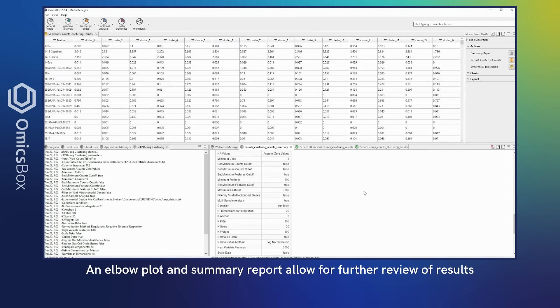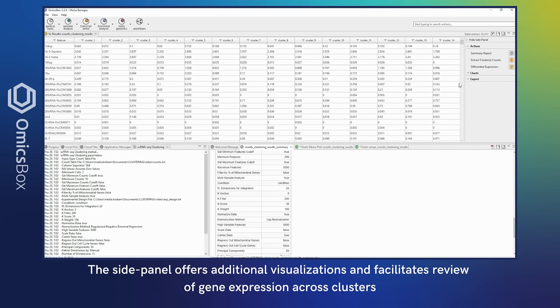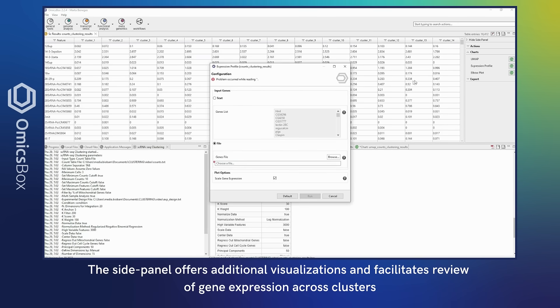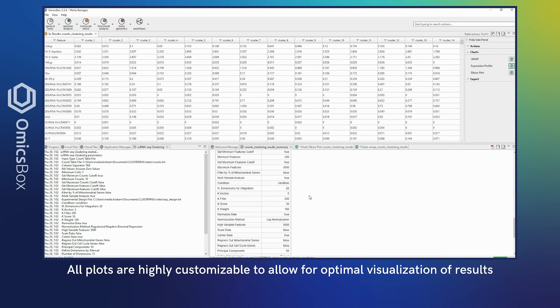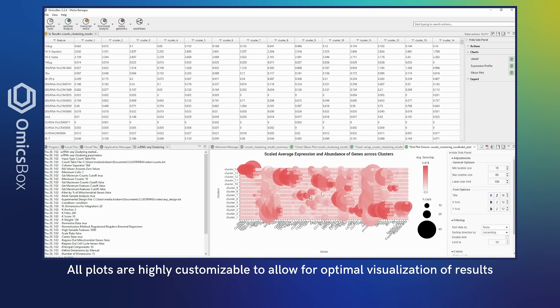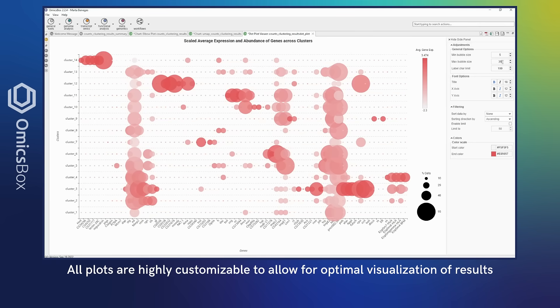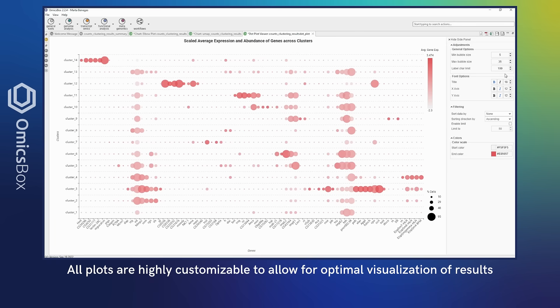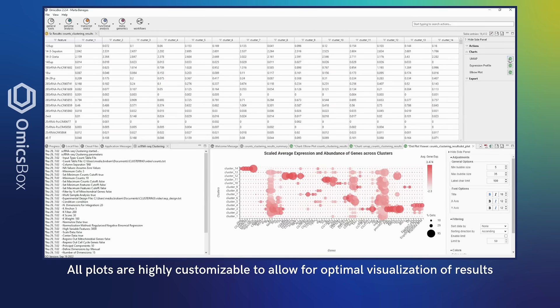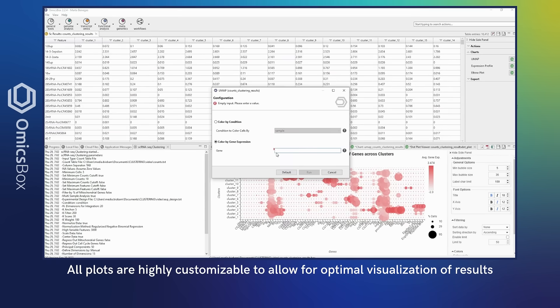The side panel offers additional visualizations and facilitates review of gene expression across clusters. All plots are highly customizable to allow for optimal visualization of results. UMAPs can be colored according to different conditions or gene expression levels.